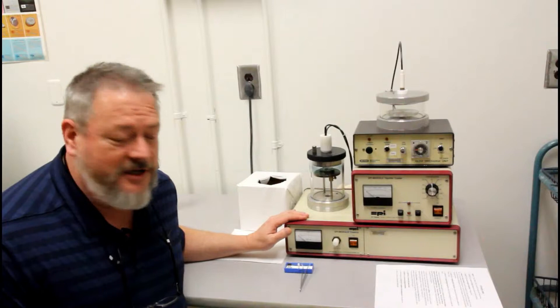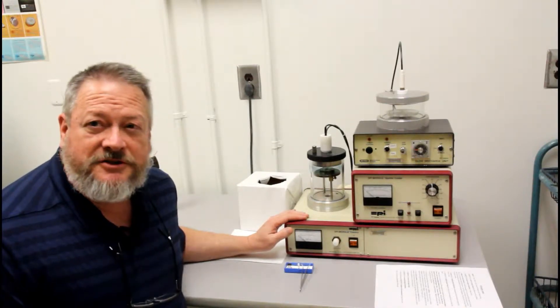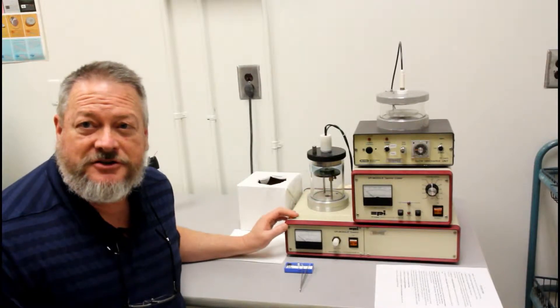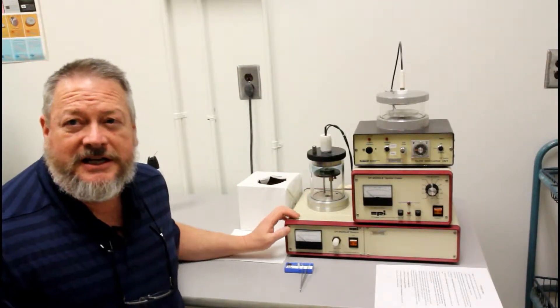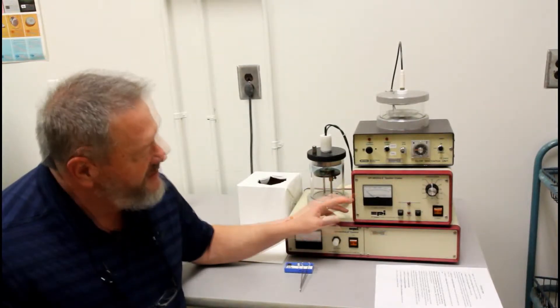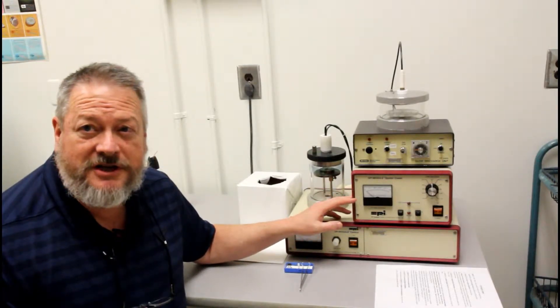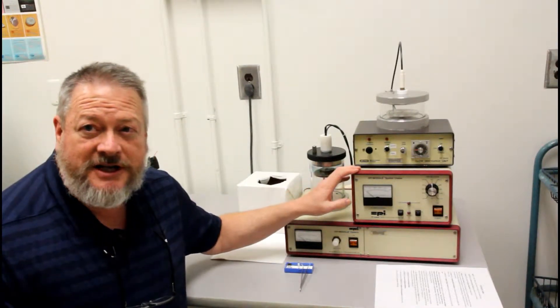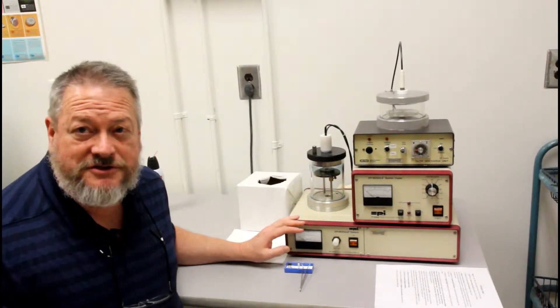At the base we have a module that controls the vacuum pump within the chamber, so you'll turn this on first. Then we have another controller, it's the actual sputter coater head, and this will only be turned on and energized once the vacuum gets to a certain level.